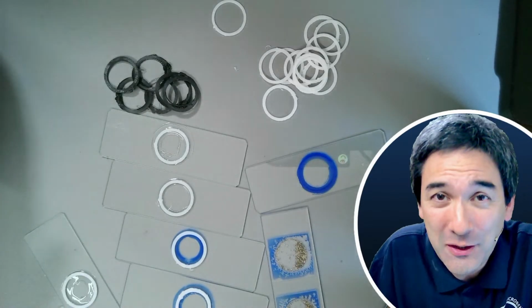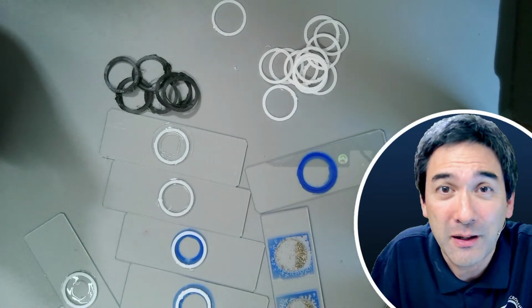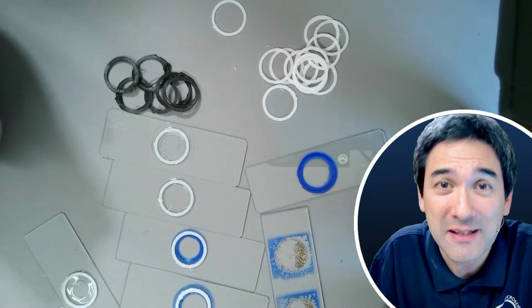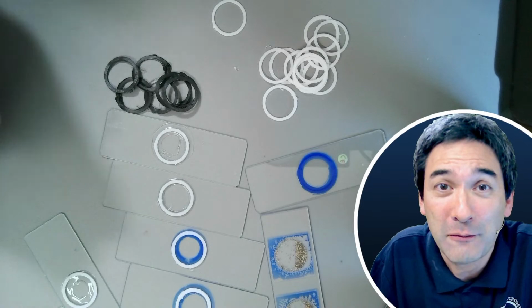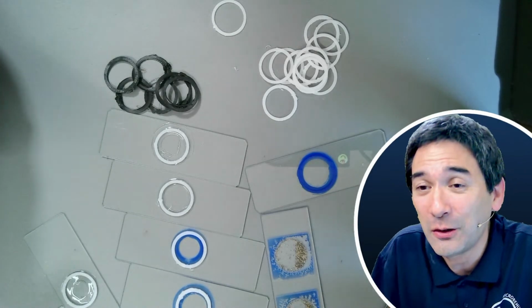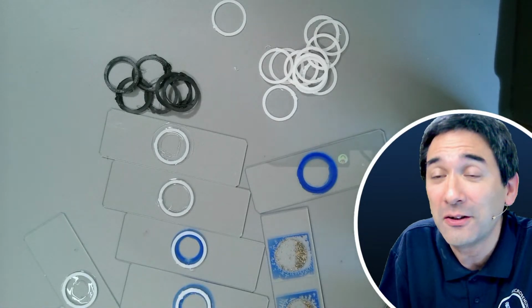Now if you're new to the stream, of course a big welcome. This is an amateur hobby microscopy stream, and today, because I'll be looking at sand, I'm going to be primarily focusing on stereo microscopy here.